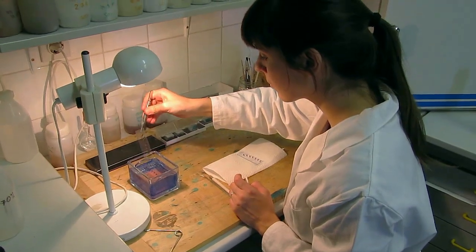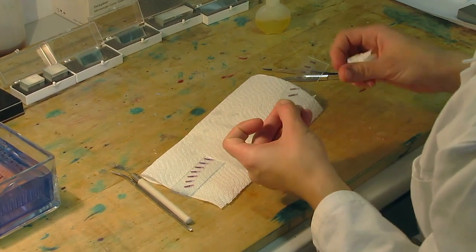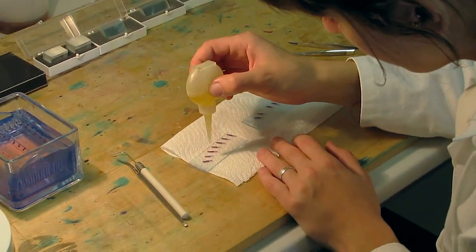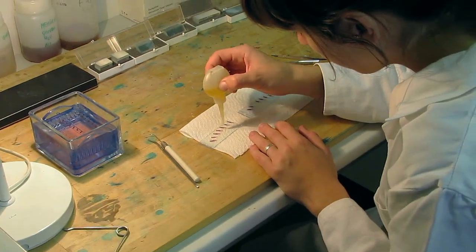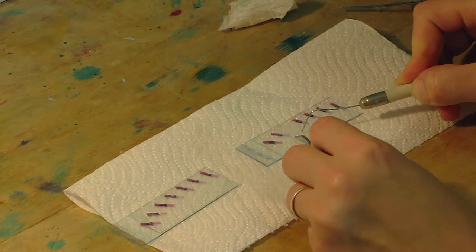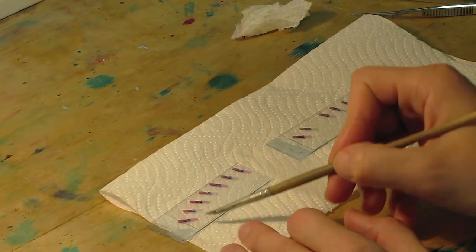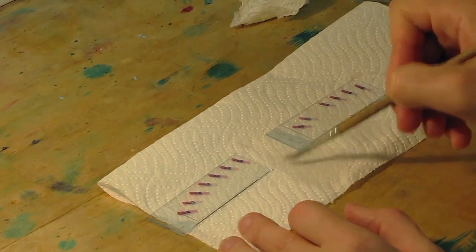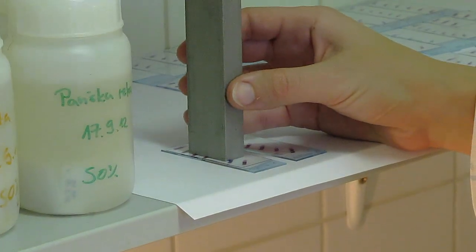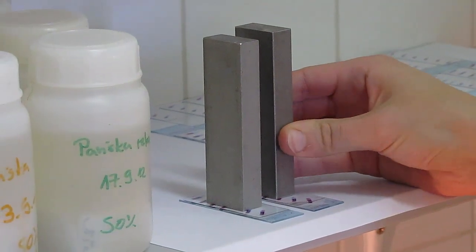Before mounting, clean the object glass and remove twisted or damaged sections. Put a drop or two of mounting medium onto the sections and cover them with a cover glass. Finally, remove the air bubbles and the excess of the mounting medium. Weight the sections with 200g metal weights and leave them for at least 24 hours so that the medium dries and hardens.